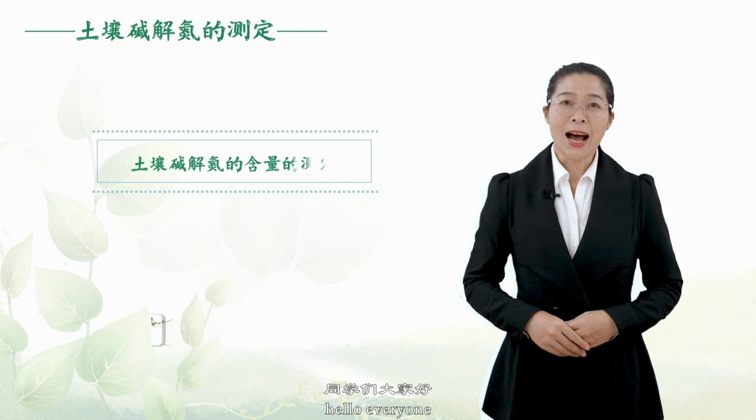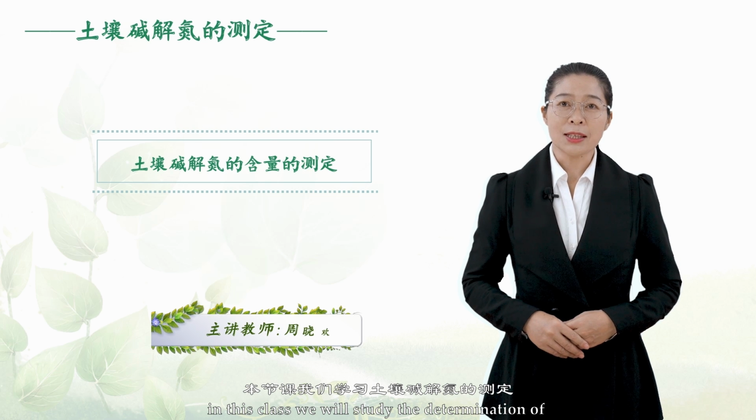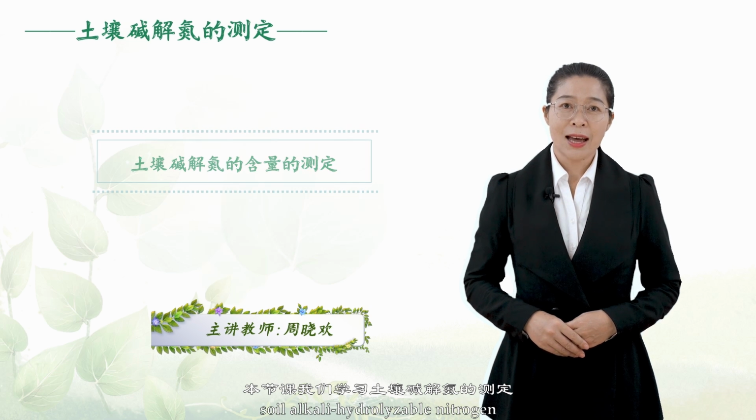Hello everyone! In this class we will study the determination of soil alkali hydrolyzable nitrogen.